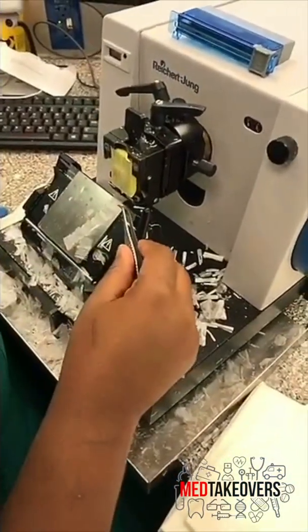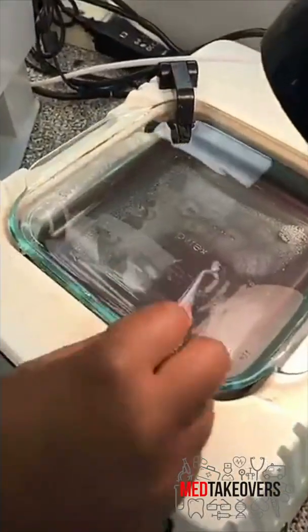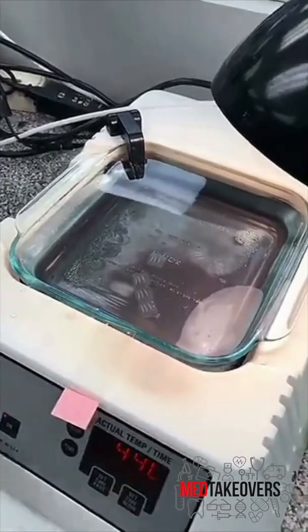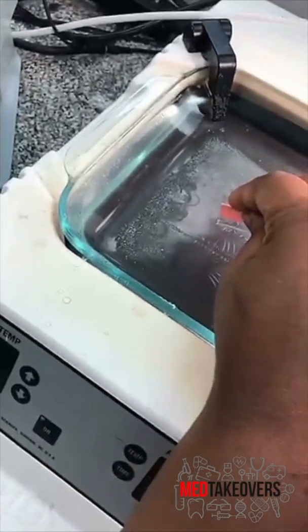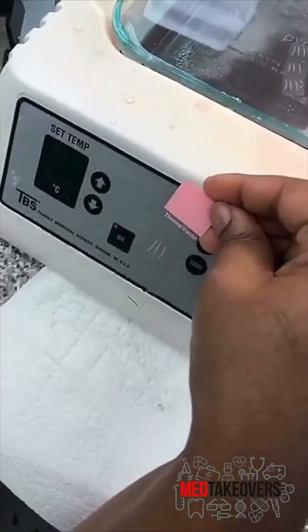So here we've cut a ribbon of tissue and we're going to put it on the water bath. You can see that it floats out just perfectly. Now our histotech cuts the little slices apart and scoops them up onto a slide. And there you go — a four micron section of skin on a slide.